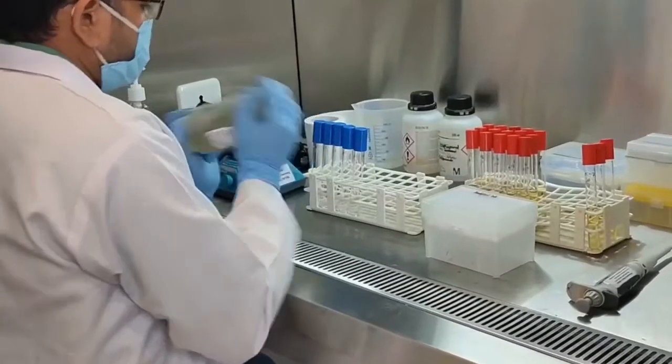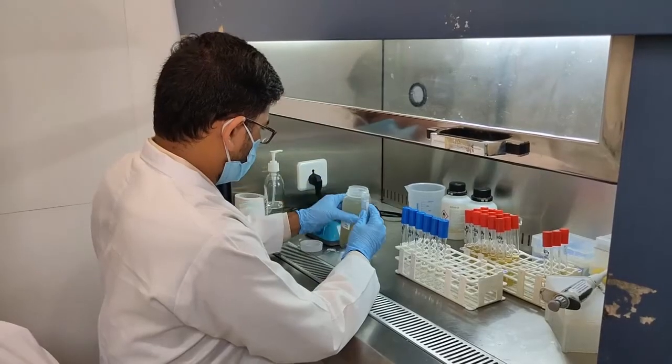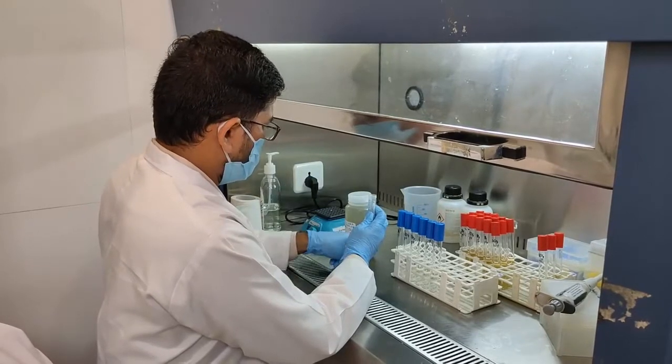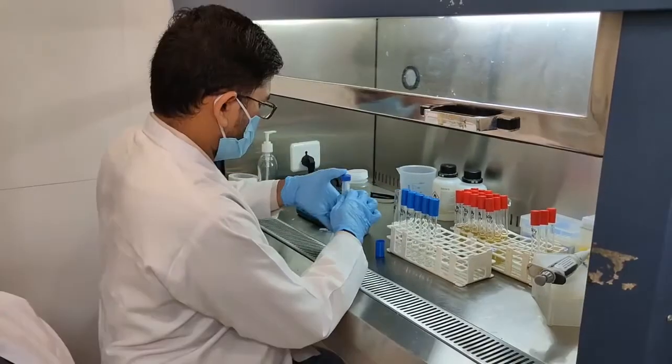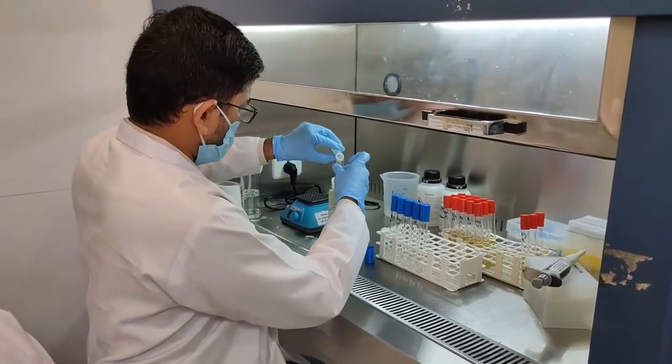Shake the sample thoroughly for at least 25 times for proper mixing. If a direct sample is used for inoculation, take about 10 ml of the thoroughly mixed sample into a sterile empty test tube.